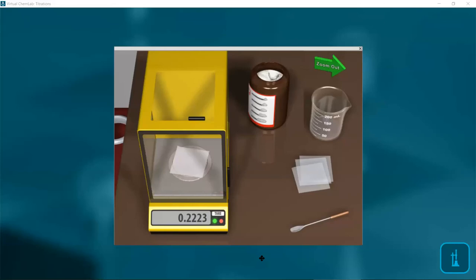Notice that in the lower right, there's a spatula, or they call it scoop. And these are really spatulas or scoopulas, they're also called. And you could pick it up and take some out of here. But Beyond Lab Z made your life easy. If you look on the label, you see the scoop, as they call it, I call it spatula, with different amounts, because there's larger ones. Click on the bottom one. Watch. Is that neat? And then hold your mouse button down and drag the spatula.